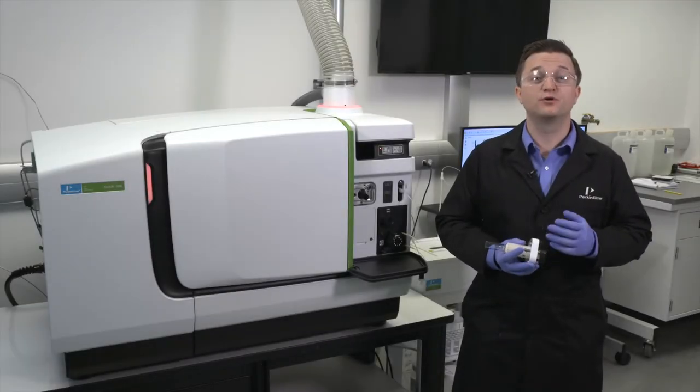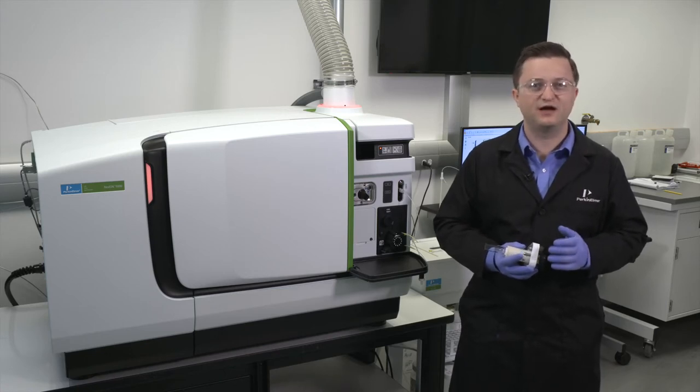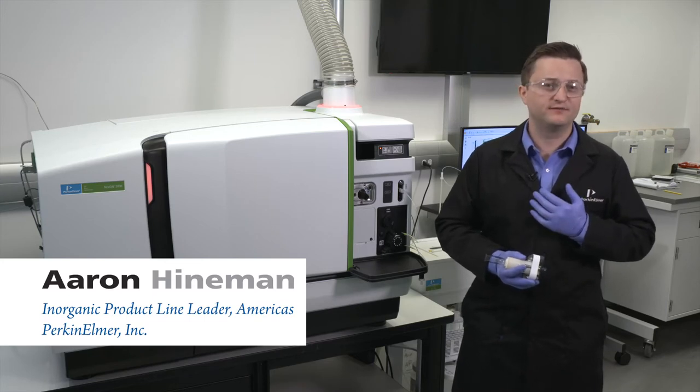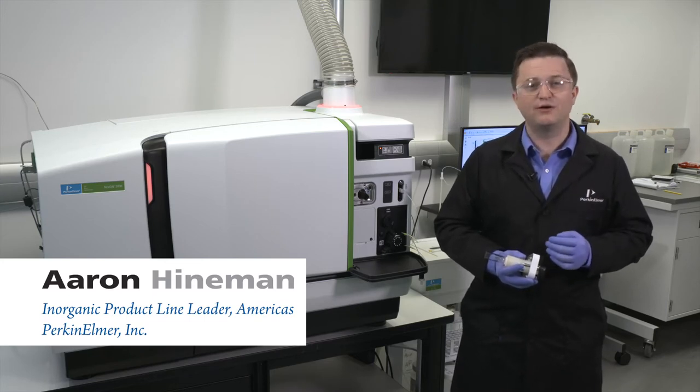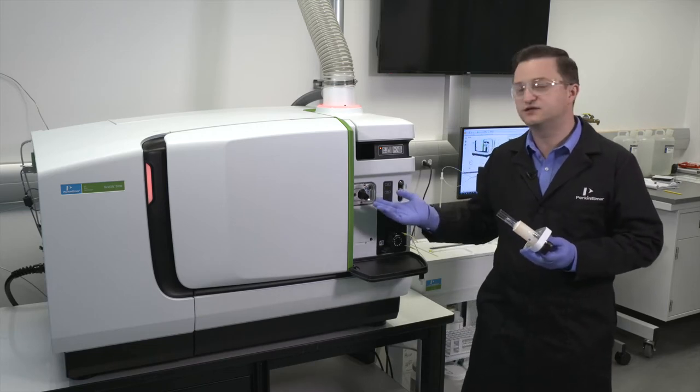Hi, welcome to a brief Perkin-Elmer video to help you get the most of your NexION 5000 ICP-MS. I'm Aaron Hineman and in this video I will describe the installation of the torch cassette into the NexION instrument.